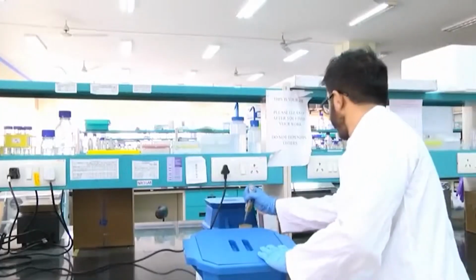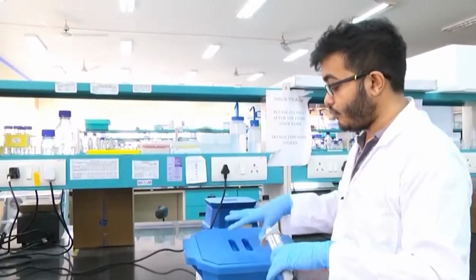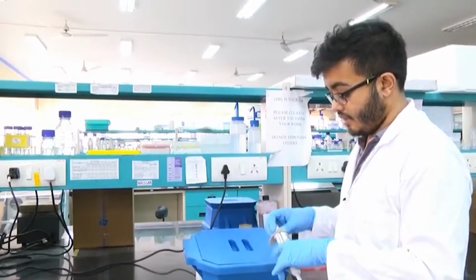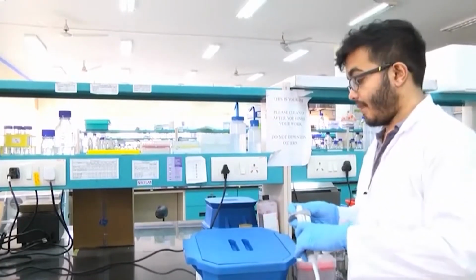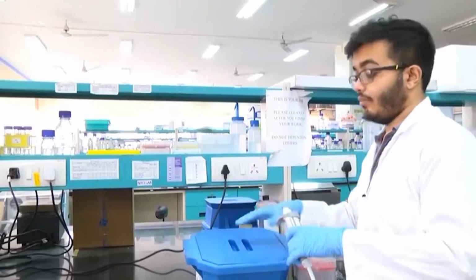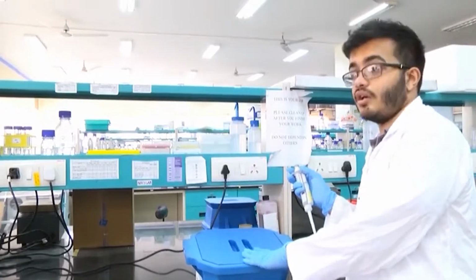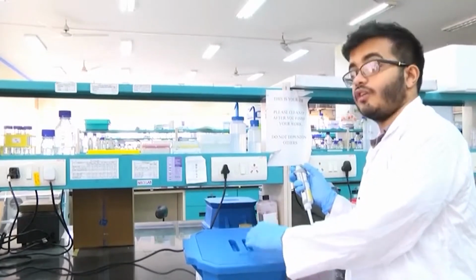So, what is happening is that the DNA is being incubated with the bacterial cells under cold conditions, and we will keep it in this manner for at least 1 hour. If you are in a hurry, you might reduce it by maybe 10 or 15 minutes at max, but my advice is keep it for at least 1 hour or if you are in too much of a hurry, maybe 45 or 50 minutes.